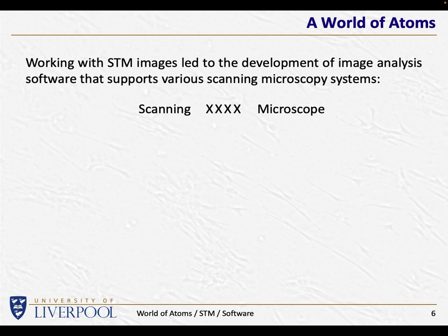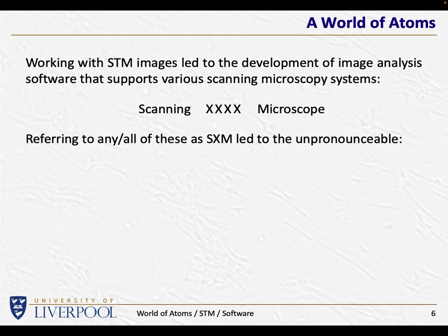So I figured that there are lots of different microscopes in the world. Some of them we've got at the University of Liverpool and we were using. There are other microscopes used in other research departments throughout the world. So I figured that there's lots of scanning something microscopes. You give me a letter of the alphabet, I can probably find a word that goes in between there. But ultimately I thought it would be useful for my students to have software that would allow them to analyze any of these scanning something microscope images.